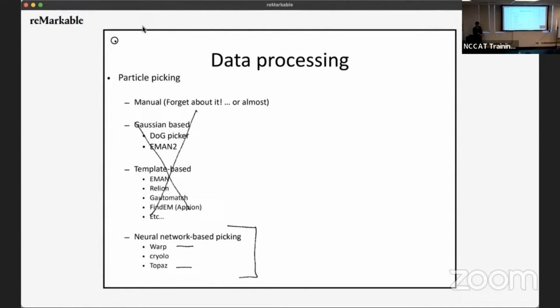Yeah. So let's say your data set has some preferred orientation. Would it then be a bad idea to create a model from your own data set and train using these tools? Because then even the model would have that preferred orientation. So you're asking, would it be a bad idea to retrain because it would have that preferred orientation embedded in the model, basically? Yeah, basically.